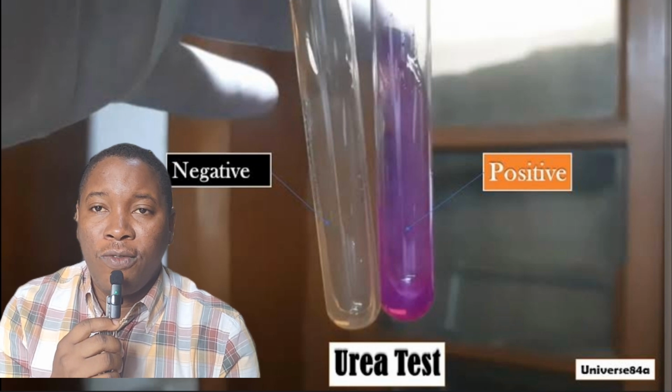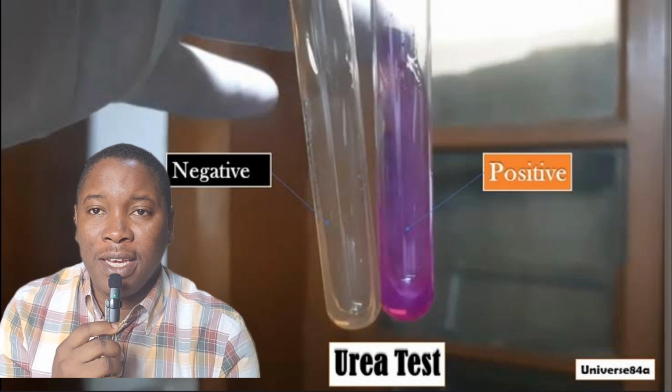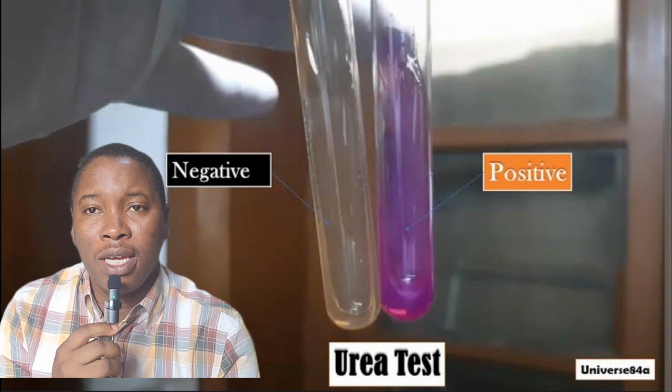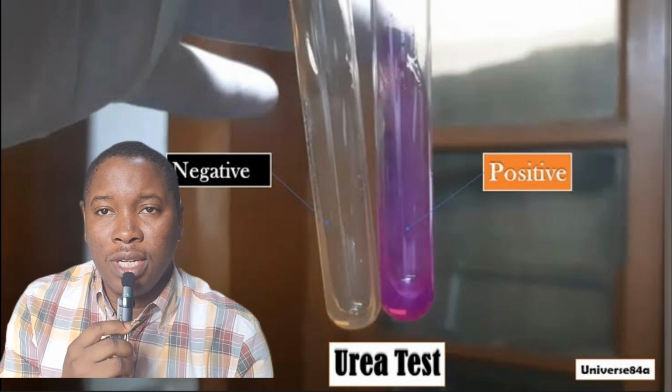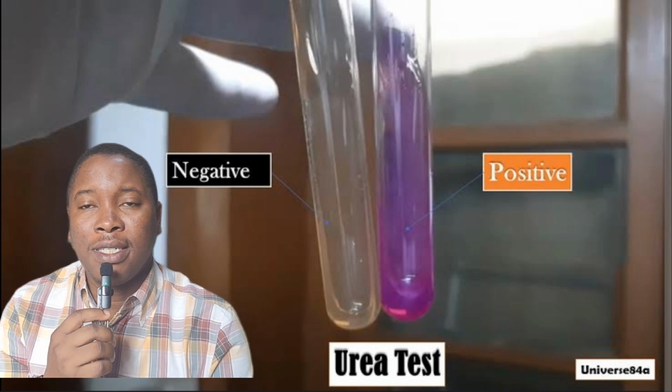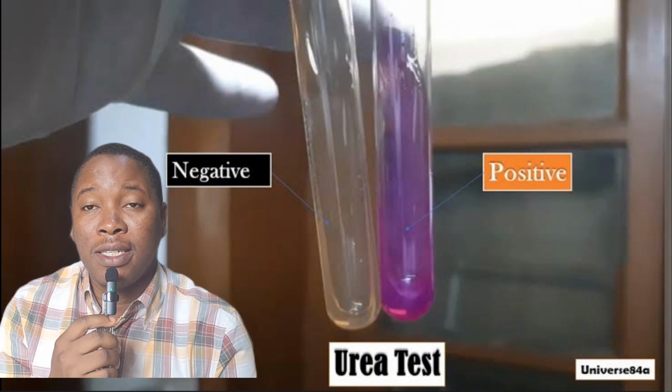Microorganisms that have the enzyme urease are able to break down urea into ammonia and carbon dioxide. So it's a simple test. If you're running the test, you're asking yourself, does this microorganism have the enzyme urease?